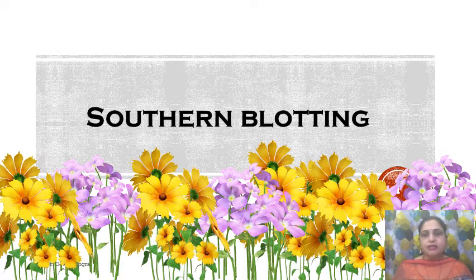Still further, there may be changes at the transcription level, that is, the production of increased mRNA, which leads to increased protein synthesis by the corresponding gene. In this video, we will explore Southern blotting technique. So, let's start.